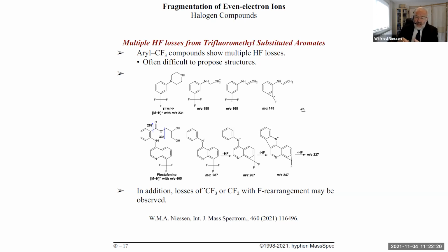As I said yesterday, we can, in some rare cases, see losses of 1 or of 2. The next loss is 15, which is the methyl. We can have losses of 16, of 17, of 18, of 20 due to fluorine. And then the next loss is 26, which would be the acetylene. And all the other values in between, which I didn't mention, are not possible.